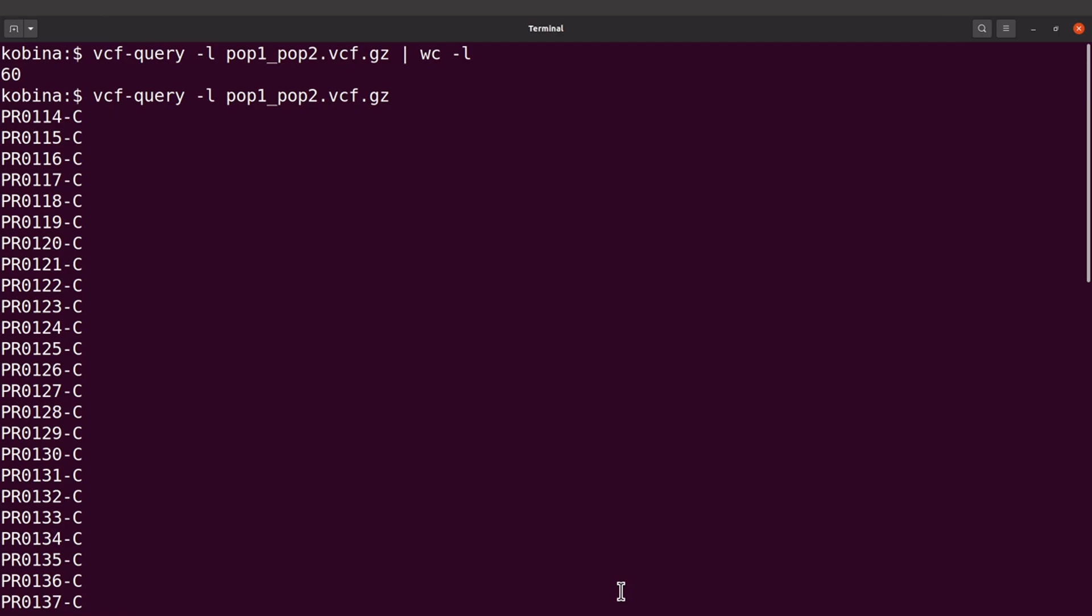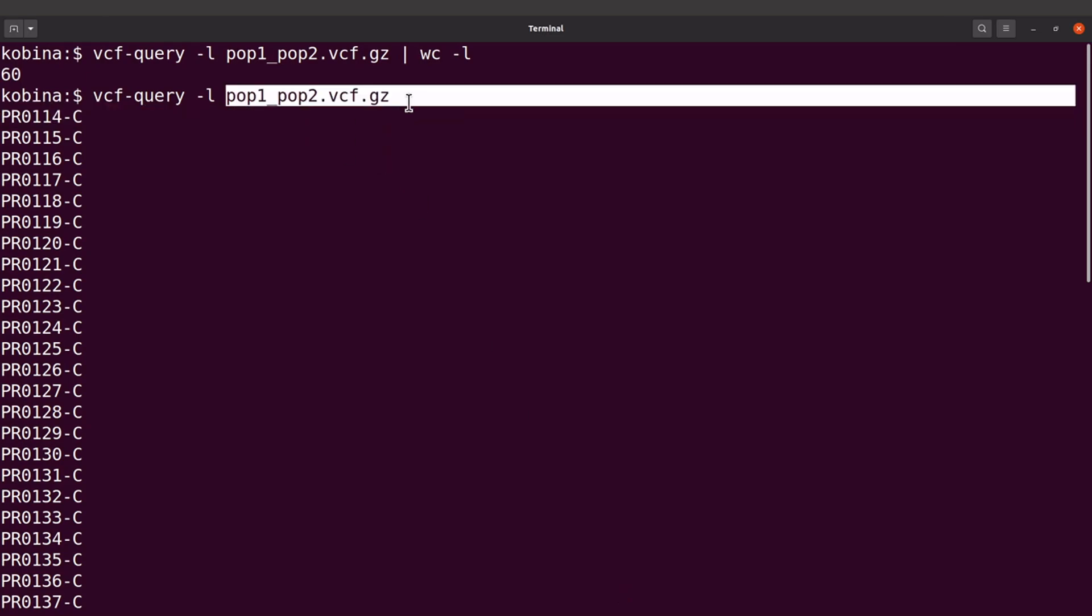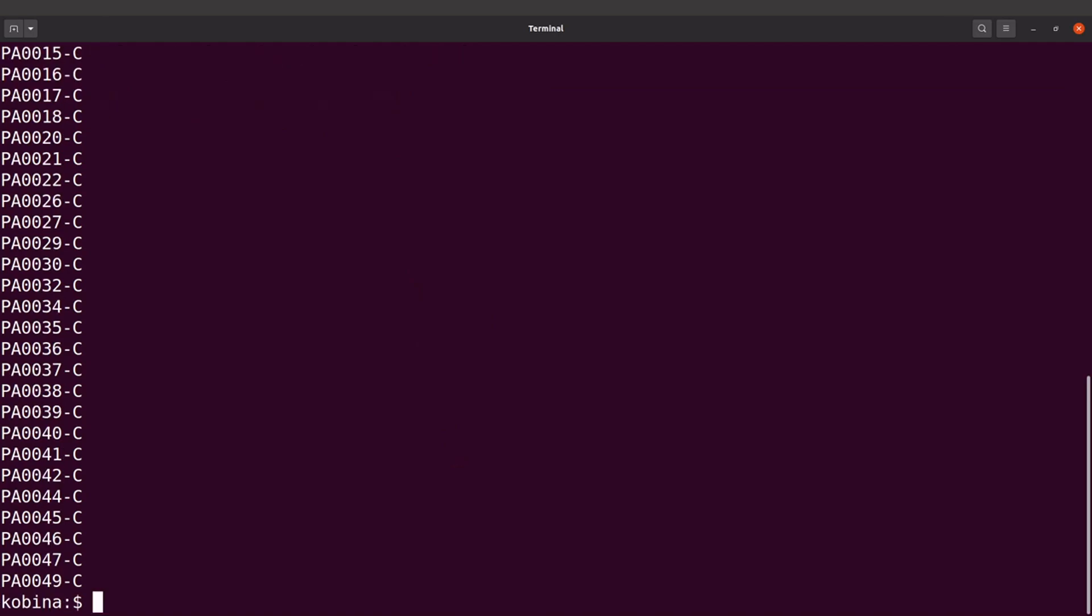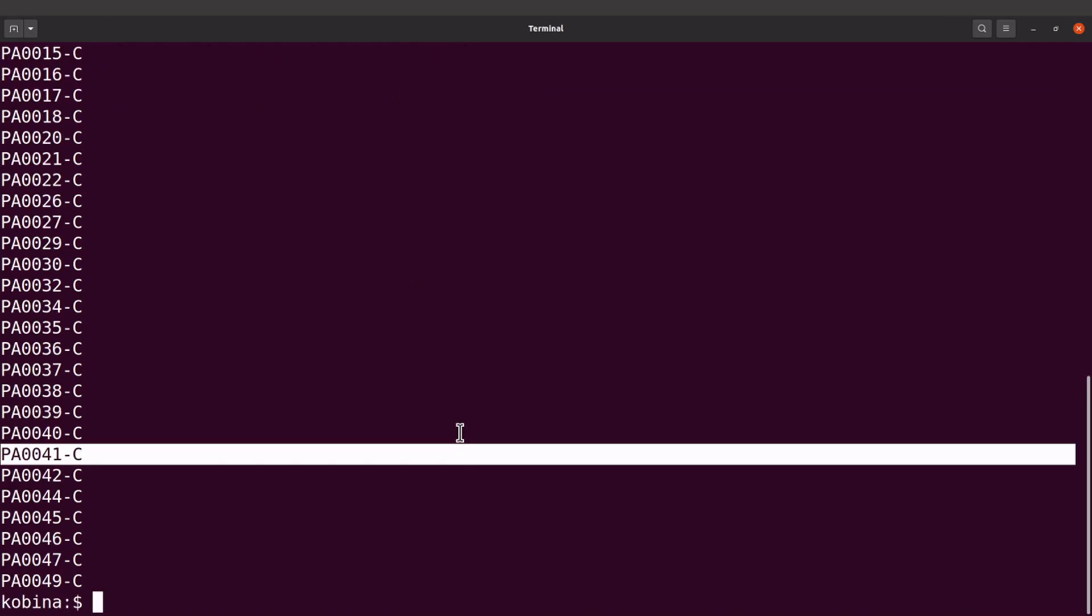Okay, these should be text files. So we are going to use some one-liner commands to get these sample names or sample IDs into their respective files. Okay, so I'll label them as POP1 and POP2 so that they match this VCF. But you can use any name as well. It doesn't matter. I just want to make sure I streamline things.